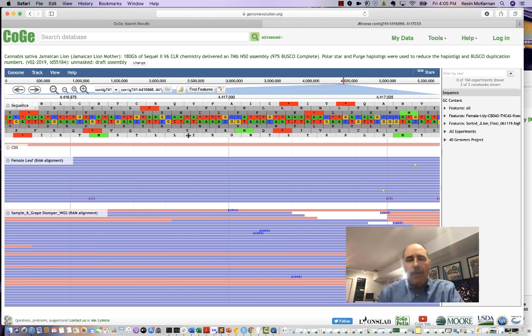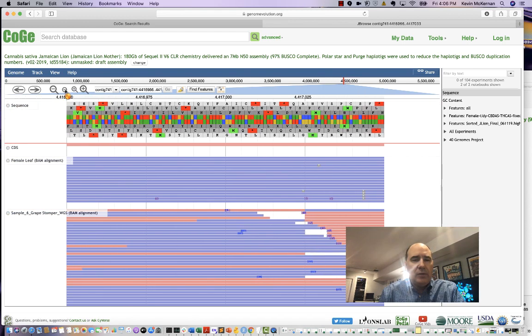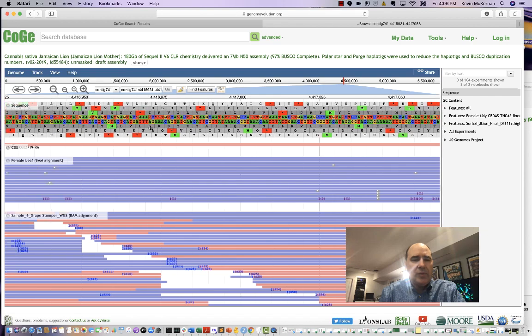Okay, so this shows you the A, T, C's, and G's. If you're not familiar with this, this is an amino acid translation in 3 different frames in the top strand and 3 different frames in the bottom strand. You can read 3 different frames of DNA when you're trying to convert it into proteins, and these red marks are stop codons. Usually genes don't have those, so one way to know what frame you're in is to look for the longest stretch that doesn't have any stop codons. And with THC synthase, it's pretty easy. You can see there's a methionine right there.